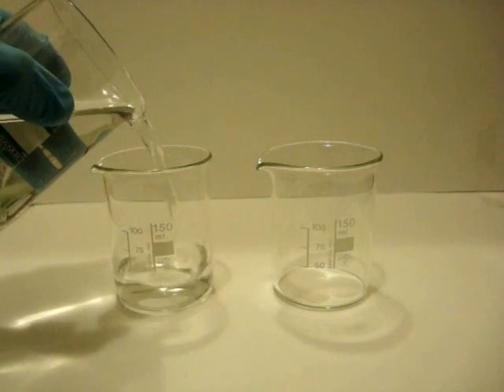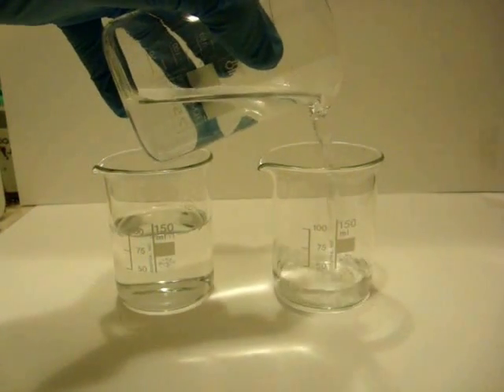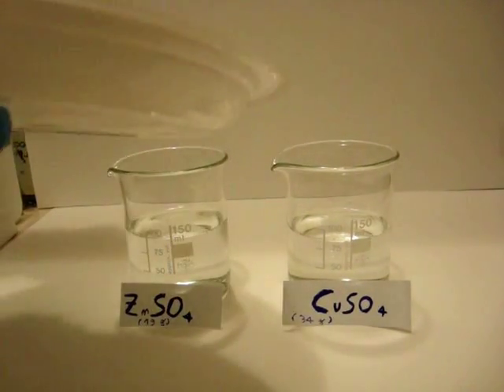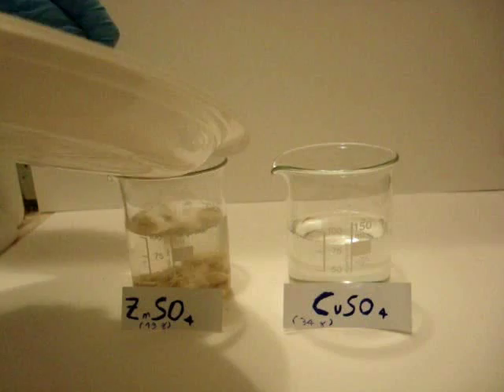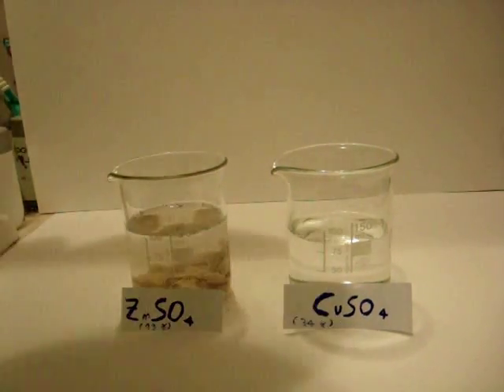Let's get started. Take two small glass containers and fill them with distilled water. In the left one put a little more water than in the right one. Now add on the left about 19 grams of zinc sulfate, and in the other one about 34 grams of copper sulfate. Mix until the salts are completely dissolved.